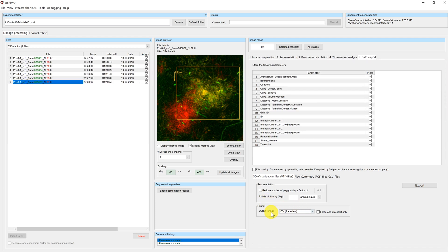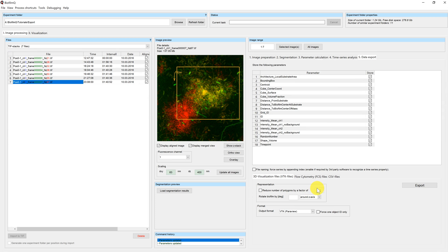Above the file format selection you have the option to rotate the biofilm by a certain number of degrees around one of the three major axes. You can also reduce the size of polygons by a factor. Let me quickly show you what the influence of this option on your 3D visualization files is.